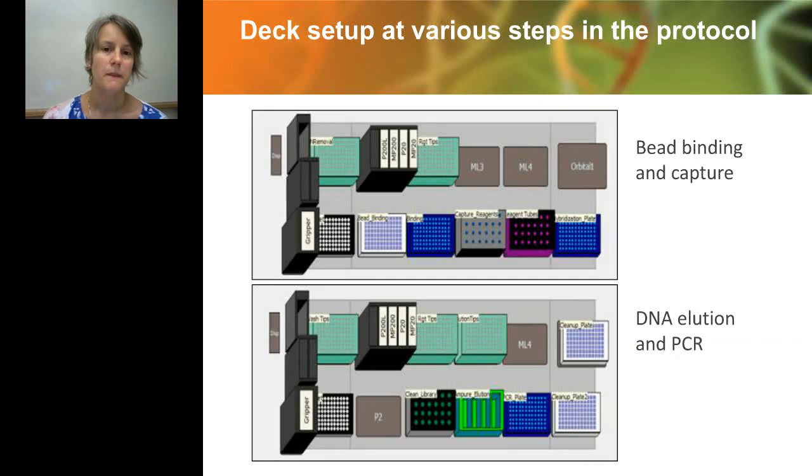So I'm just showing here the different deck layouts and the different tools and instruments that we've been using to set up these protocols. So we have a chill plate and a magnet here, so those are important for some of the steps in the HaloPlex as well. And then also just showing that we can use a reservoir for different cleanup steps and for reagents that you can use a larger volume for.